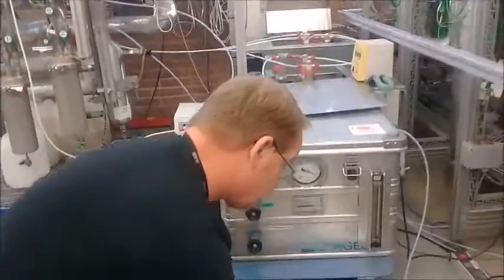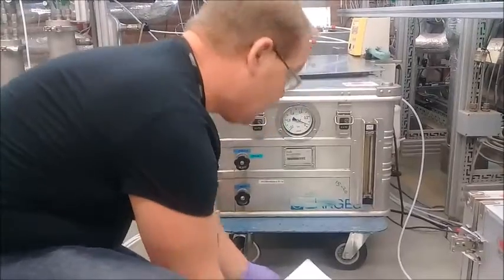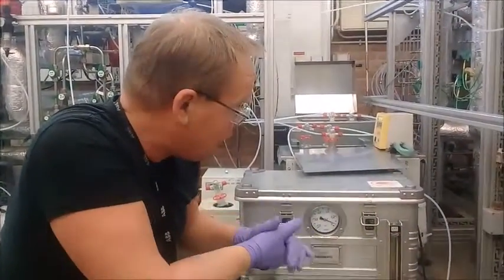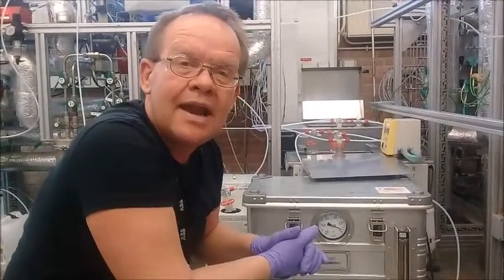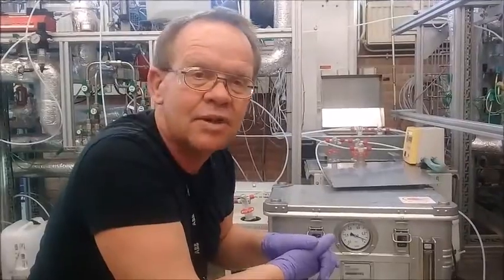I also record the time, which is 8 minutes past 11. So I also write that down. And in this way we sample for like an hour, and in an hour we will have around 200 liters of gas passed through the bottles.